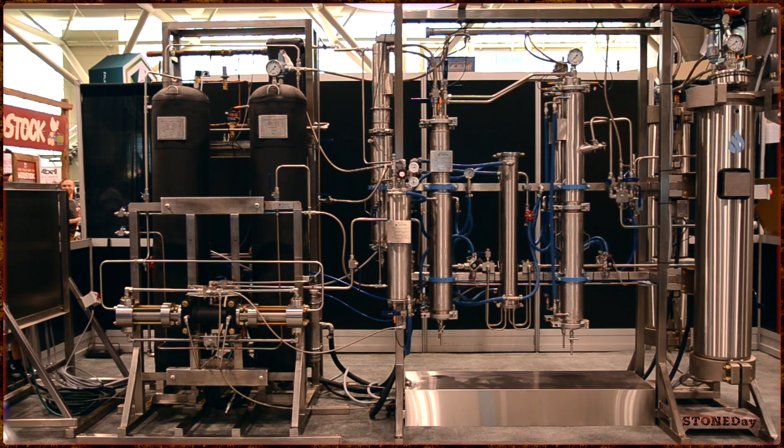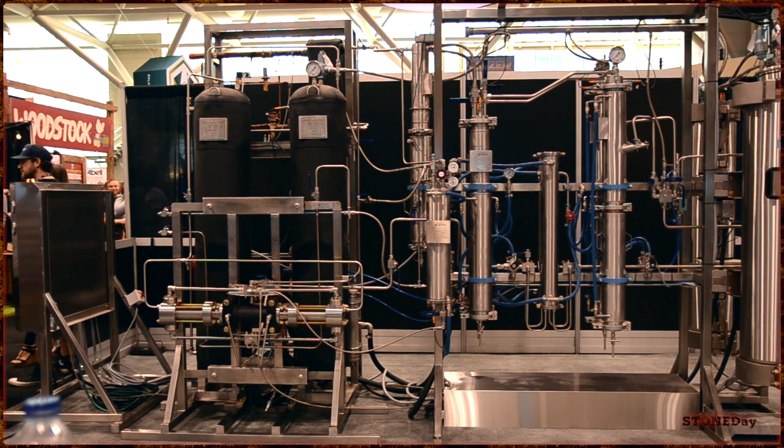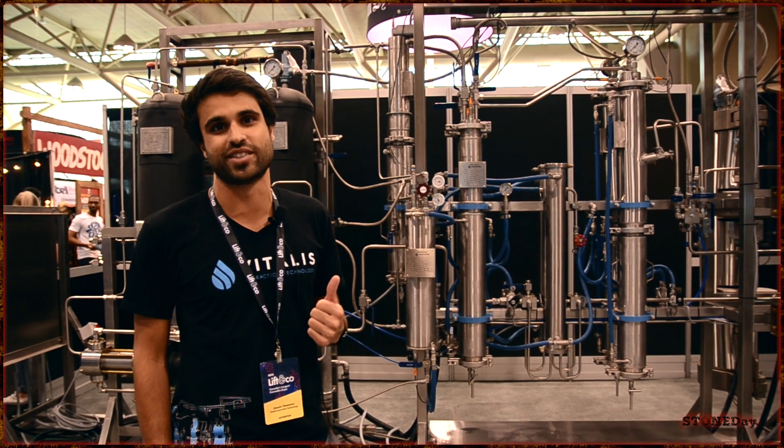Hey guys, my name is Jason Hammer from Vitalis Extraction Technology. This here is the Vitalis Q90 extraction system.